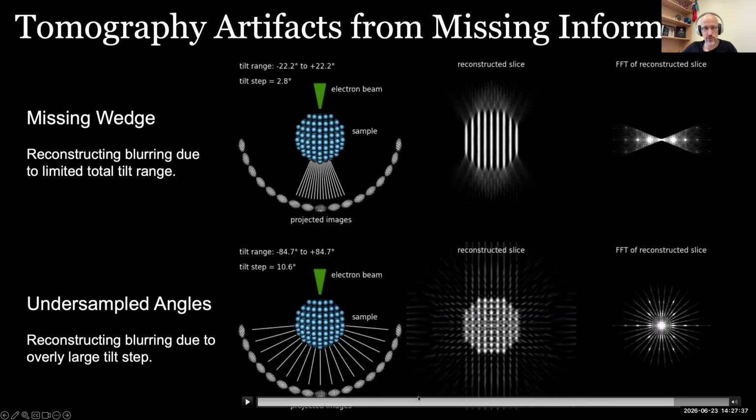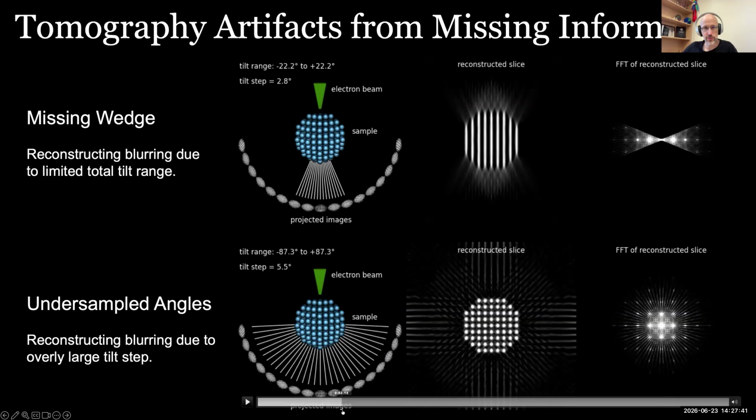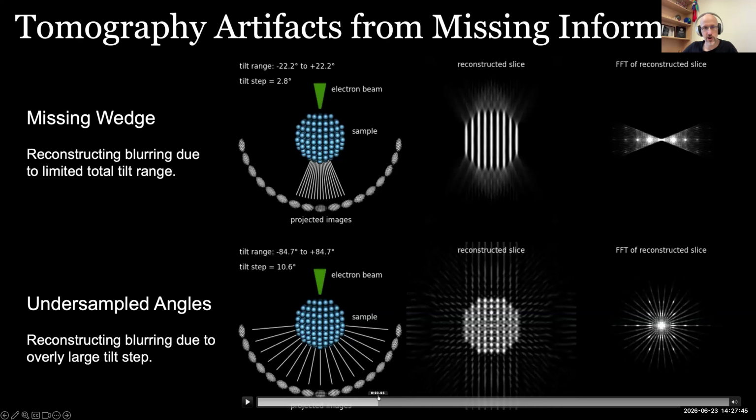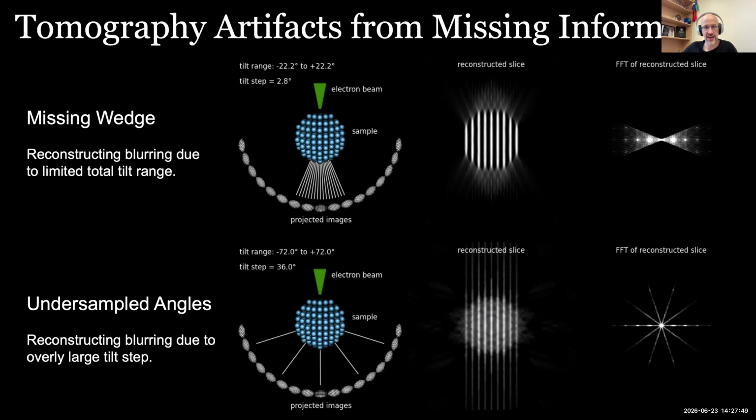So again, pausing this movie, here I get all the atomic details. If I remove every other plane, I get some streaking, but it still looks relatively good. However, if I go really far and I remove a lot of atomic planes, all the sites are going to smear into each other here.